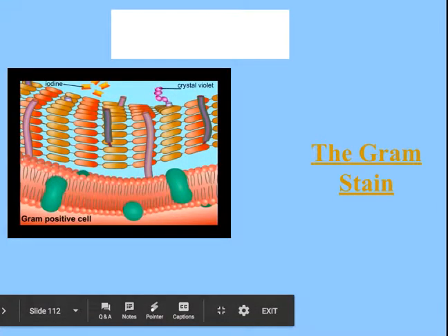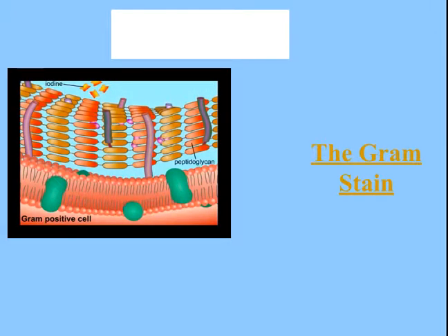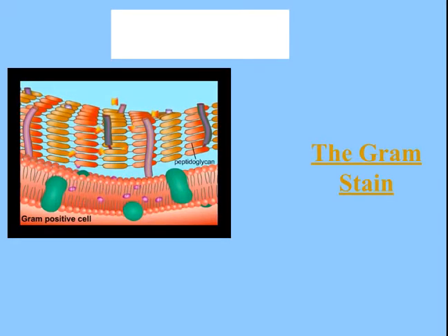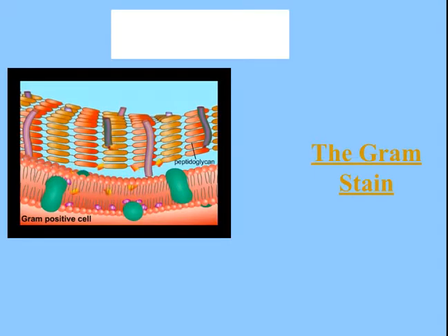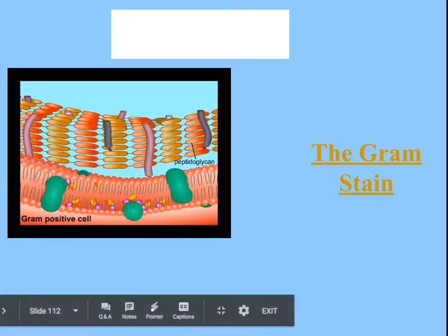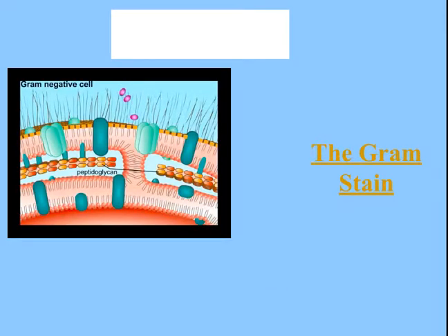Generally, the Gram stain correlates with the cell wall structure among the bacteria. The ethanol is thought to shrink the thick peptidoglycan in gram-positive cells, thus retaining the dye. The thick dehydrated peptidoglycan layer of gram-positive bacteria appears to be a permeability barrier, preventing the loss of the crystal violet iodine complex. In contrast, the peptidoglycan in gram-negative bacteria is very thin and has large pores. Ethanol may extract lipids and increase the porosity, thus removing the crystal violet iodine complex.